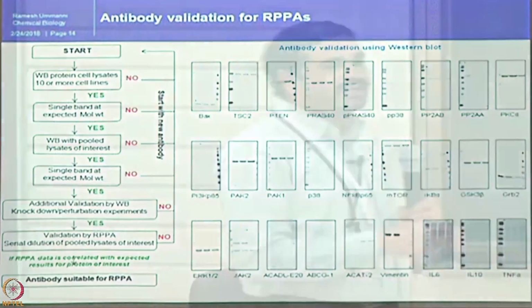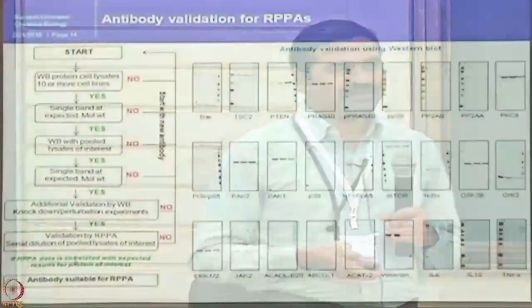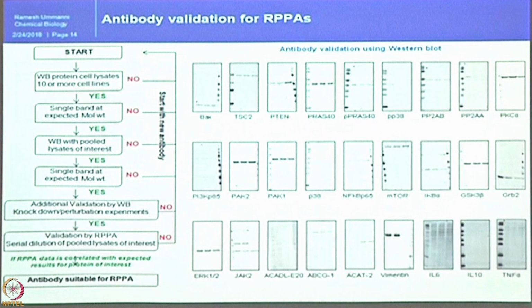And every antibody will get one of 3 codes: go ahead, use with caution, and not suitable. These are the 3 different phrases in the RPPA community we keep on hearing. So, for antibodies they write a code, like go, no go, and use caution. These are the 3 words we exchange by emails. You can see that this is like a pain.